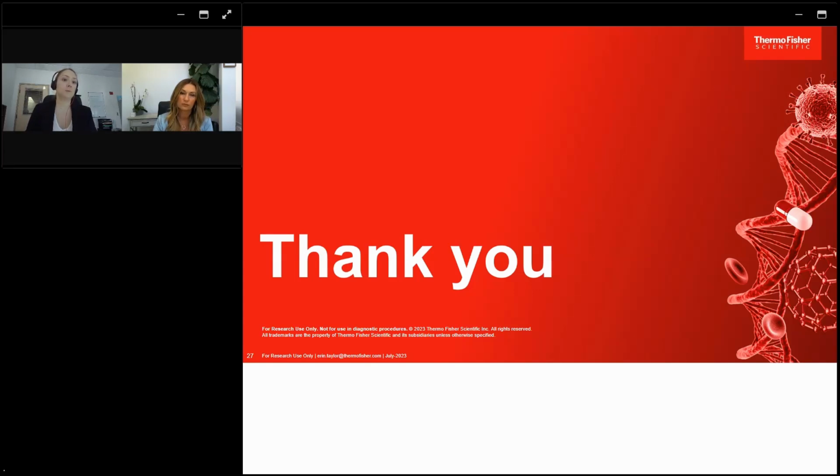But one of the things that we do suggest is, always after processing your images, go and review, and we didn't go over this here, but go and review the image annotation and masking that the software is doing, and just make sure that the data is going to be reliable for your applications.